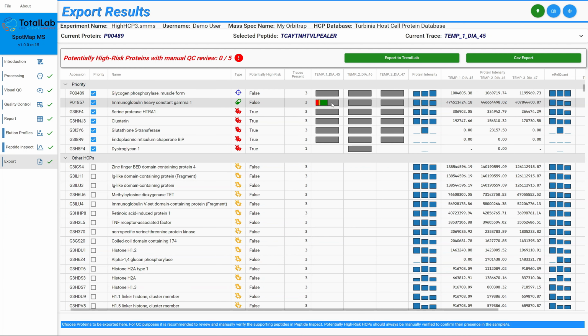So by taking this approach, we've combined all the benefits of automation of checking our matches and things like that, but we have given this step whereby a human is involved, because the results of this are incredibly important to drug safety and drug stability. We still have humans being able to be in the loop, be part of the validation and verification process. So it's not completely automated, and that's by design for safety.